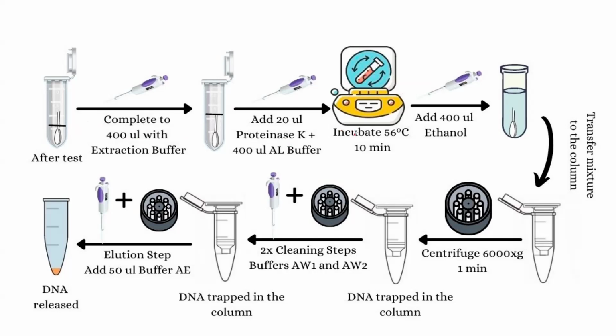Then the next thing is incubation, at 56 degrees centigrade for 10 minutes.